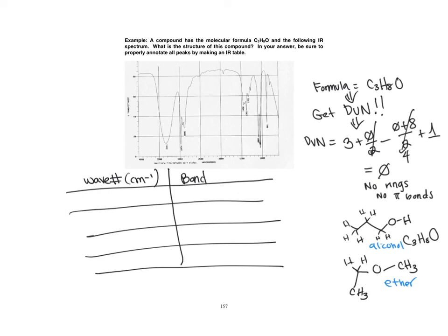In addition to the carbonyl peak, the OH peak is probably equally important. So if we go back to our chart that tells us the wave numbers, we'll see at around 3400, we have the really broad OH peak, and that's this one. So that tells us, voila, we have an alcohol. So thanks to this OH peak, it's called the OH stretch, we have confirmed that we have an alcohol.